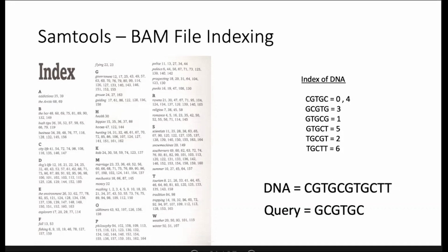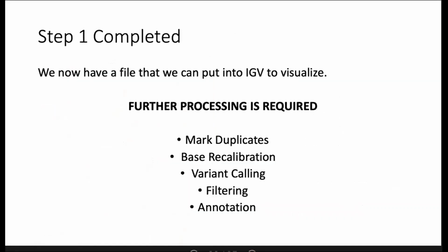The reference genome is also indexed. I've done that for you earlier in the package that I had included. This is a different kind of indexing, a much more thorough one that's also done through Samtools. Now that all these processes are done, we are ready to start visualizing our data.